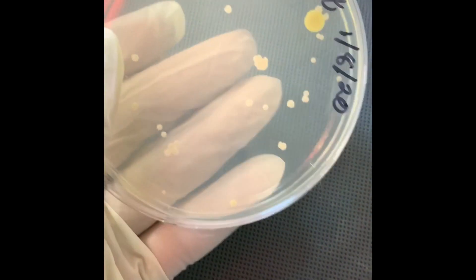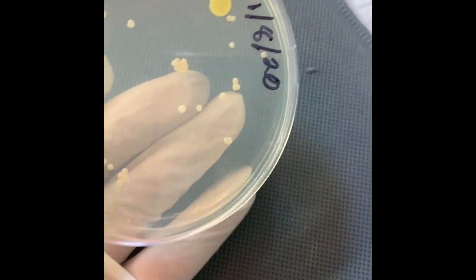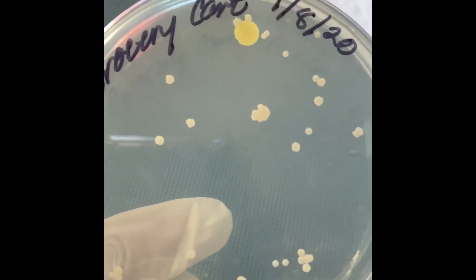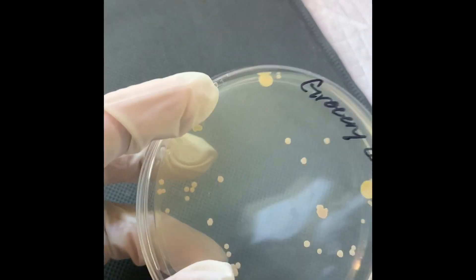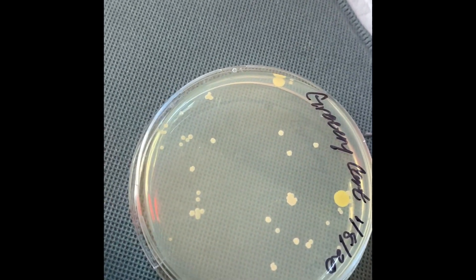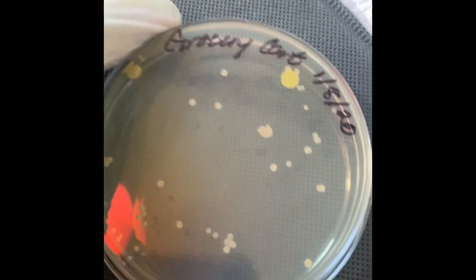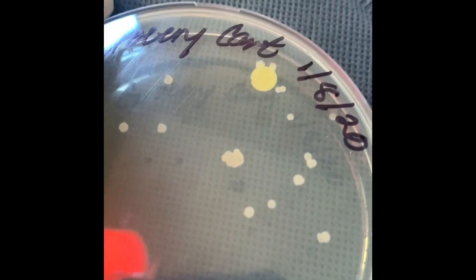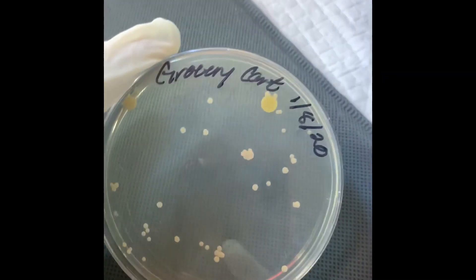So this is the grocery cart plate, sample taken August 1st, 2020. Look at all those colonies. I would say it's roughly 50 colonies, so 50 times a million — there are at least 50 million bacteria on this grocery cart.